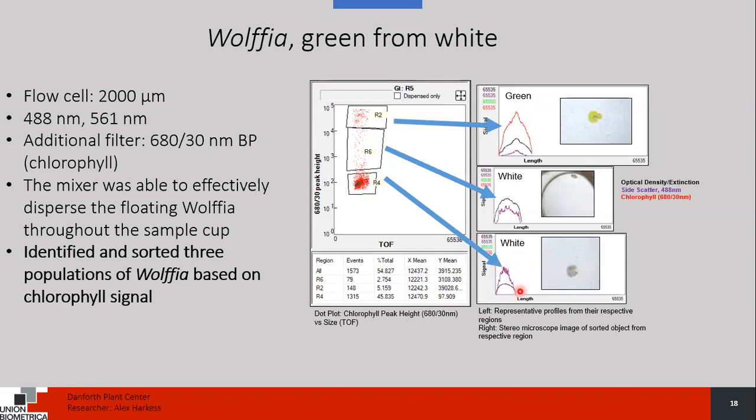You also see a higher level of side scatter, much higher than you see with those that have the highest level of red. So those up here have low levels of side scatter, and down here, higher levels of side scatter. And those that are intermediate seem to have an intermediate level of side scatter, but still very low or no red signal. So again, this now allows the researchers to parse these out and see what's going on here.